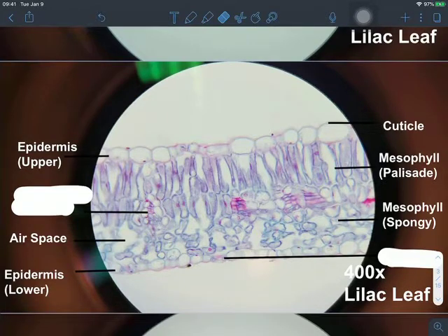That was the epidermis, but rather the mouths are the stomata, and you can see a stomata here, the opening being present right there, and then two guard cells on either side. You also have two guard cells here with the stomata here. So you see that there are air spaces and places for air to penetrate because the leaf is going to want to breathe in that CO2. You guys remember that from photosynthesis.